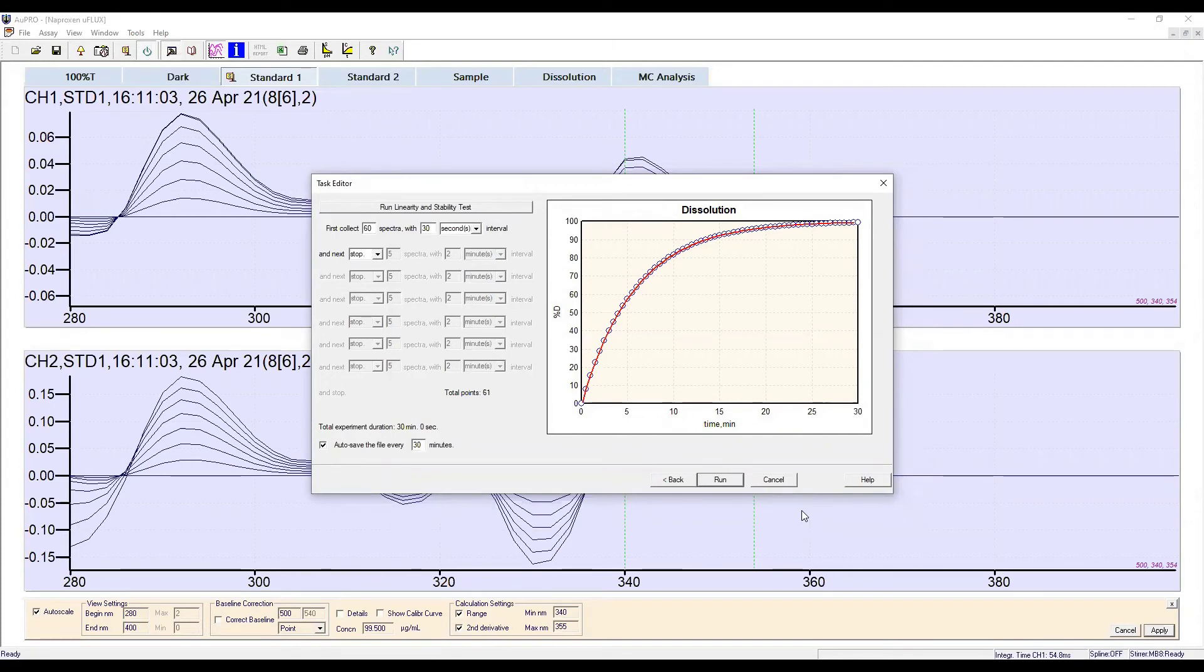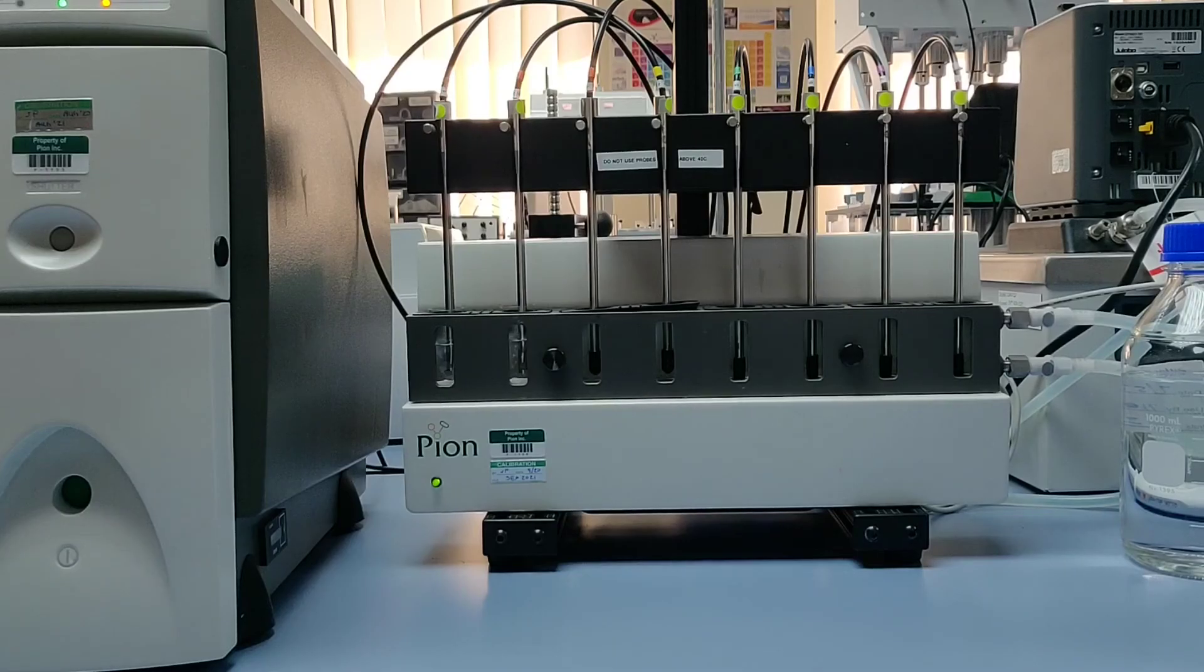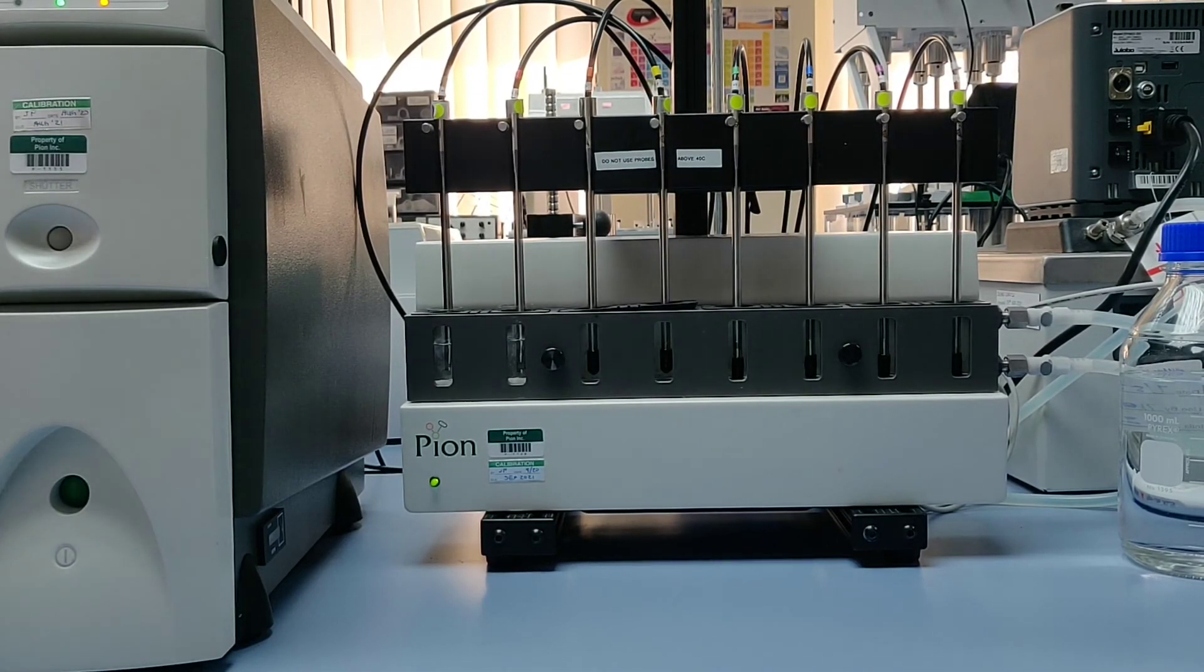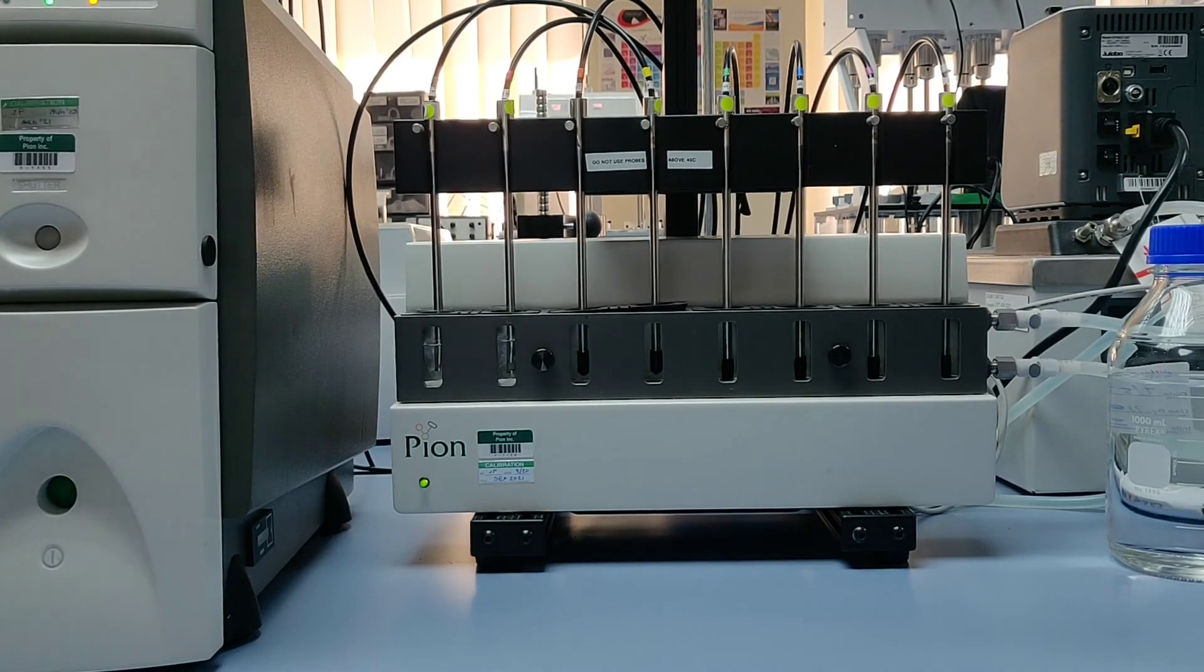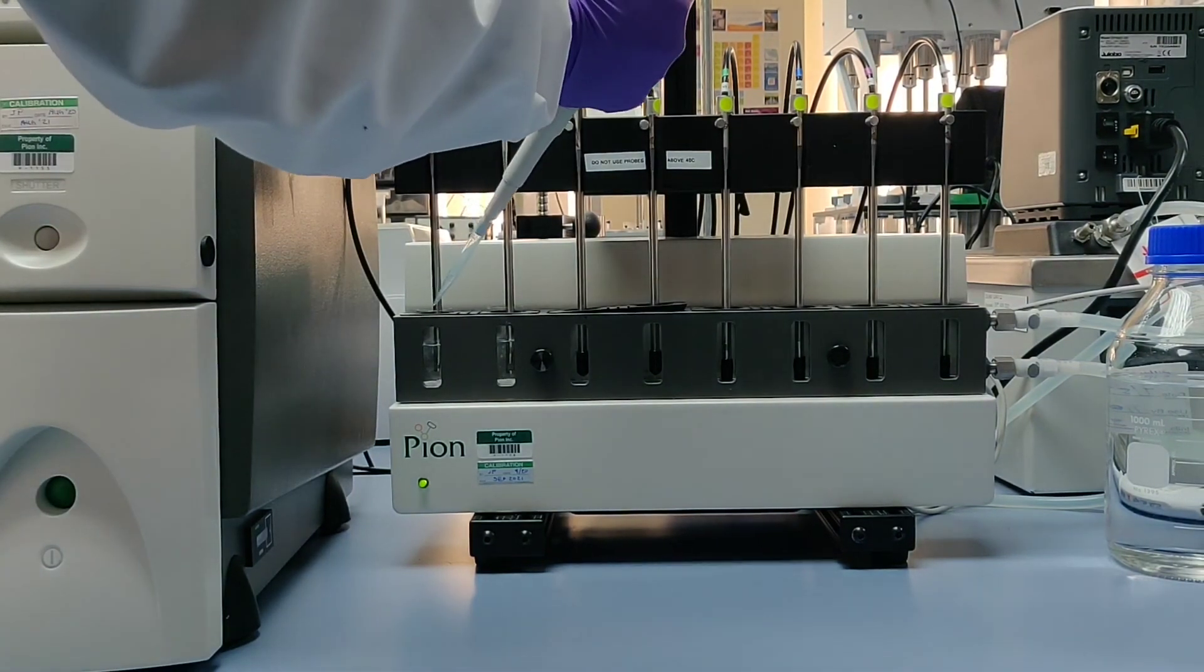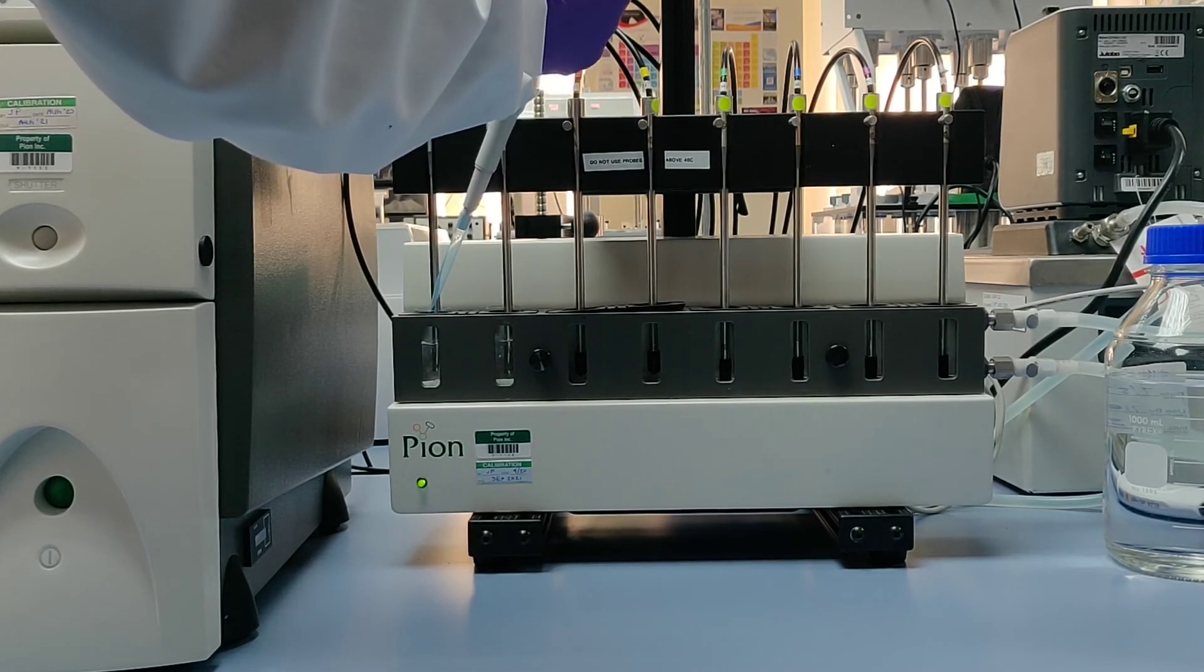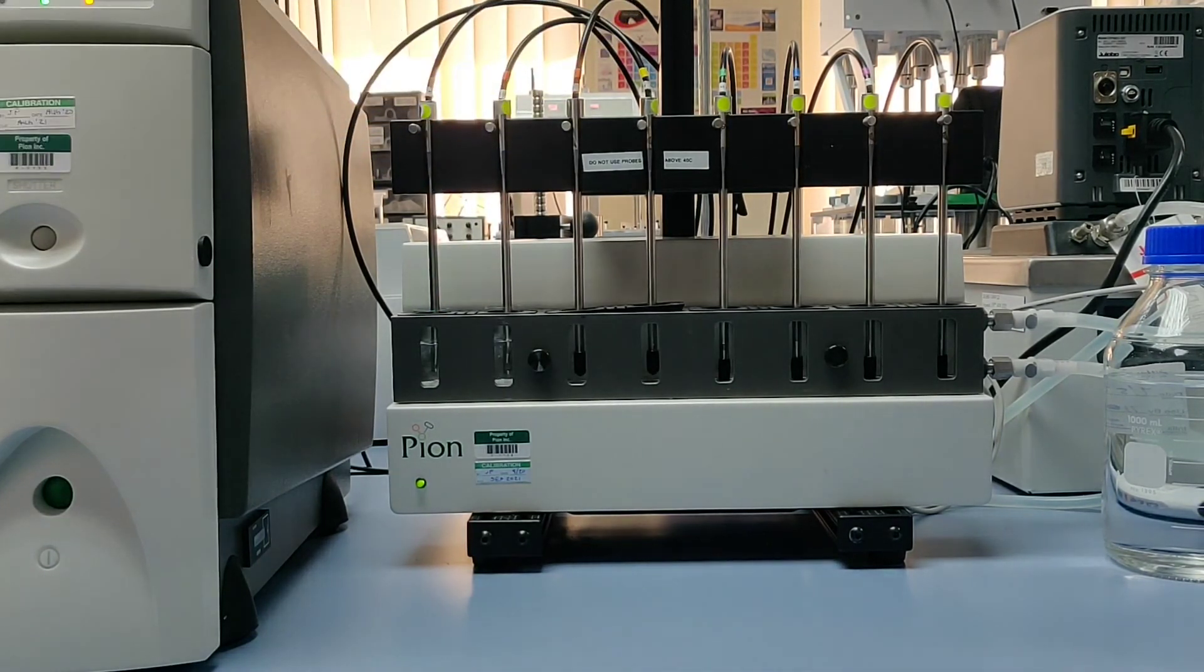The assay is now ready to run. Clicking the run button will initiate the start of the assay. All samples should be ready to add to the vessels. For our example, a concentrated stock solution of naproxen is pipetted into the donor chamber. The volume added is equivalent to a loading of 5mg.